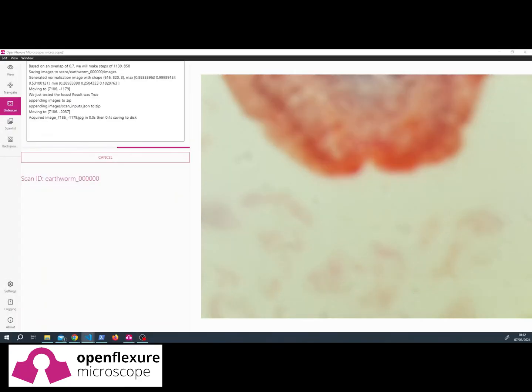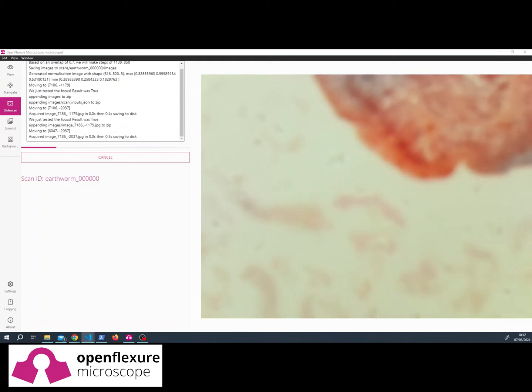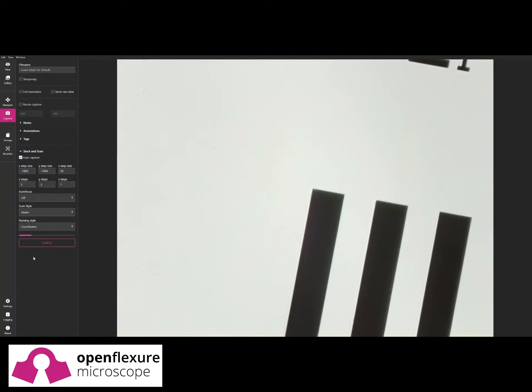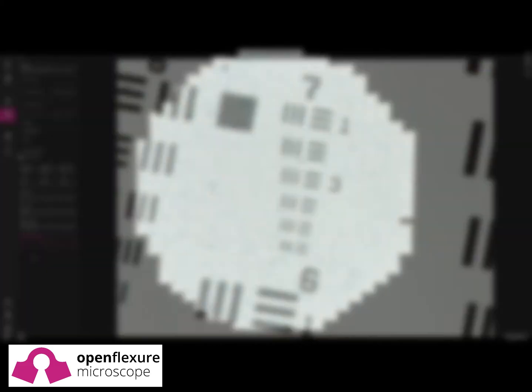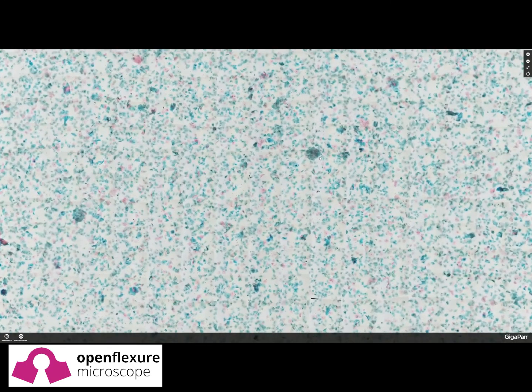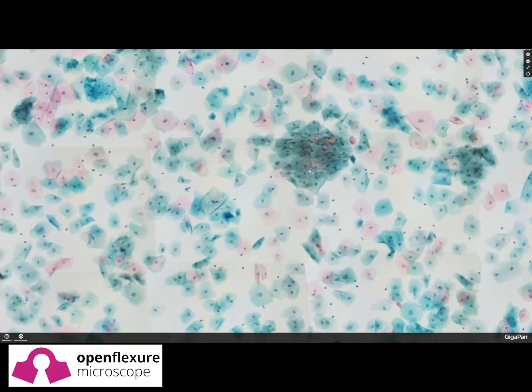The finished microscope can run automatically for several hours, scanning samples with a built-in autofocus. The 8MP camera is comparable to many commercial slide scanners, achieving a resolution below 400nm. In practical terms, this means that individual cell damage or parasites can be identified on a microscope with parts costing under 300 US dollars.